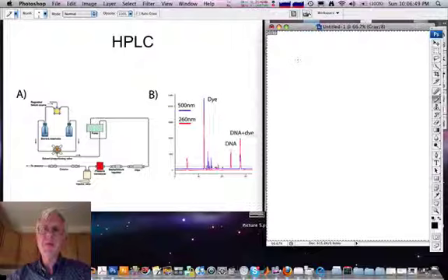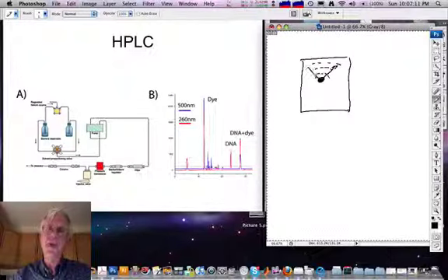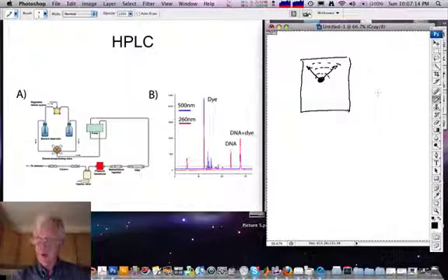The name comes from the fact that it was discovered many years ago that if leaves were crushed up in a solvent and put on a piece of blotting paper, eventually the components would spread out at different rates, and you would see different colored bands on the blotting paper as a function of the time that it diffused through the paper. It turns out that different chemicals will stick to materials in a matrix for different characteristic times, with the result that the diffusion rates through the matrix depend on the chemical identity of the compound.